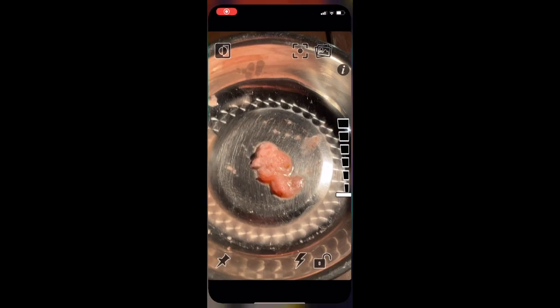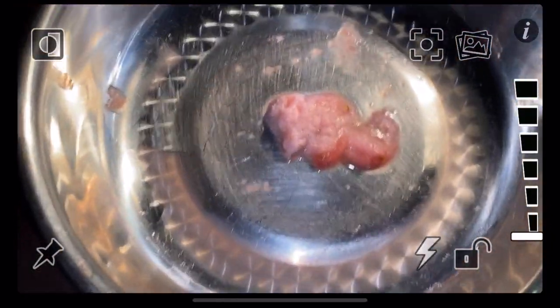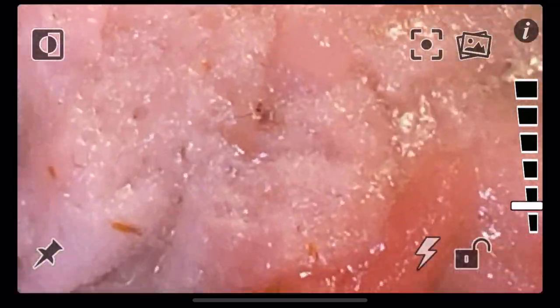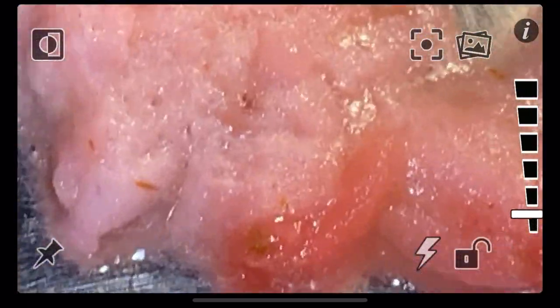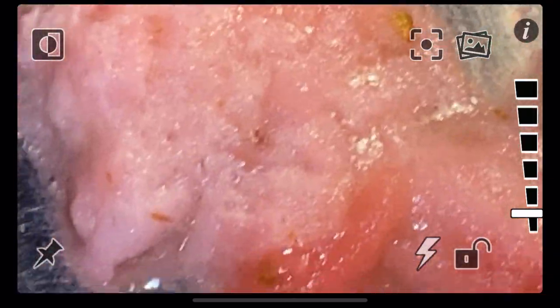You can get a better look at your DNA using the app Supervision. I recommend turning on the flash for a better picture. You can use the cursor on the right-hand side to zoom in and out of your DNA. In the top left-hand corner, you can also change the lens to a black and white view. When you are happy with your image, click the lock icon and take a screenshot. Upload and share your microscopic photo. Good luck and have fun.